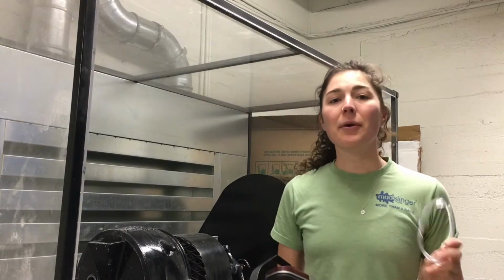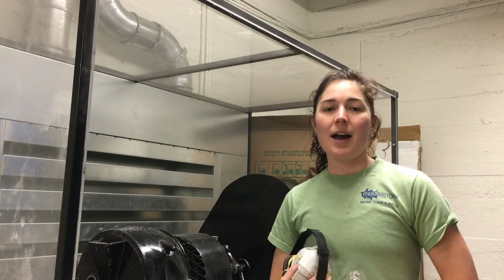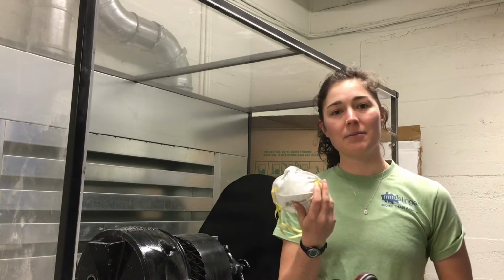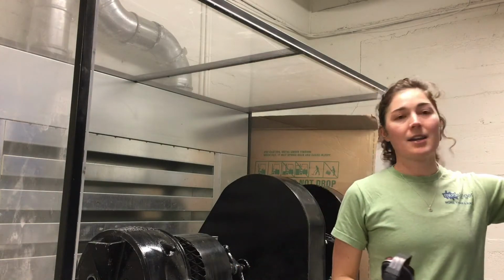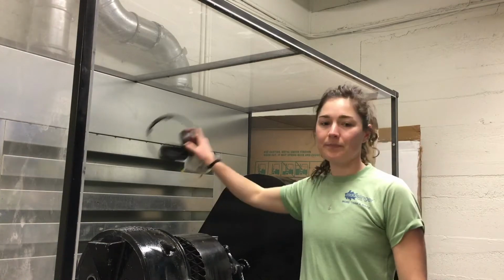And perhaps even more important than cleaning is PPE, personal protection equipment. I wear safety goggles to protect my eyes, a mask to protect my face from dust, and headphones to protect my ears. In addition, we have a dust collection system that sucks dust up in the back of this room to collect all those extra particulates.